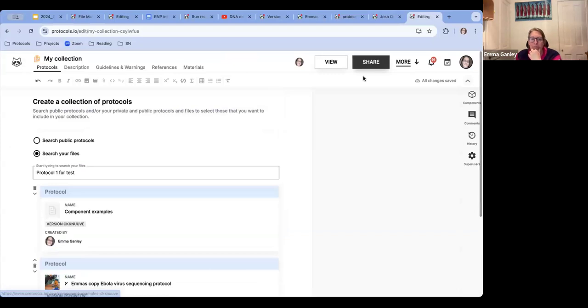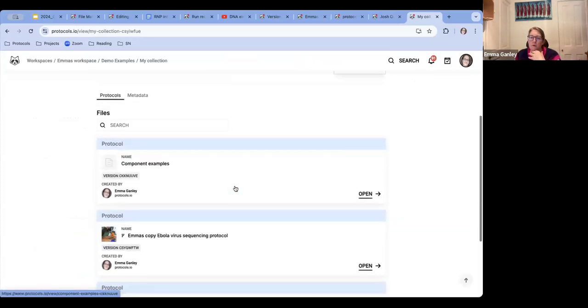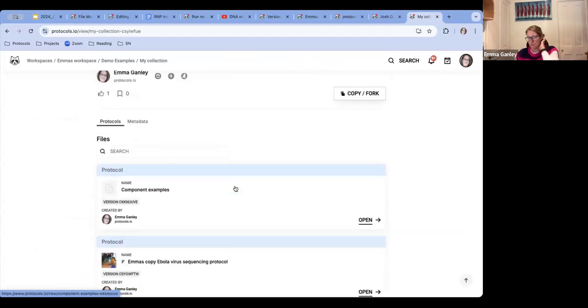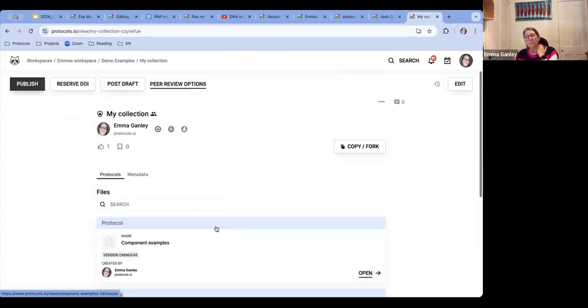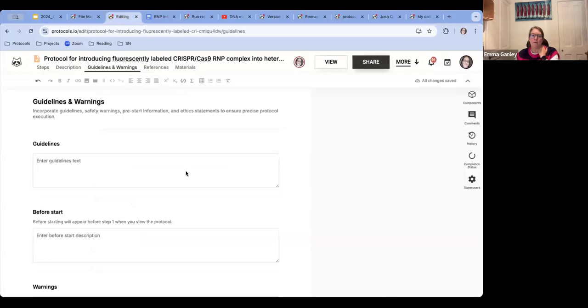I'm going to flag to the developers that something a bit funny is going on when I'm searching just now on those, but it gives you an idea. You can see what is possible with that. I think sometimes it gets warped because I have a kind of super user functionality. But that is a nice segue into sharing and publishing, which is one of the last things I was going to show. You can individually publish any protocol that you've made.